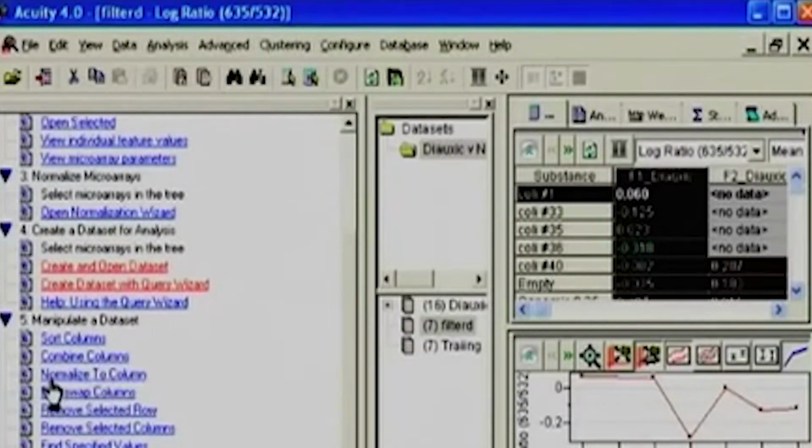So also I can do different ways of combining columns. Why you need to combine columns. Say for example, I have given 3 technical replicates for each, and then biological replicates of 3. So I can just take an average of them, combine the columns, and it will take an average of all of this. And you are ready with the data to go ahead for the analysis part.